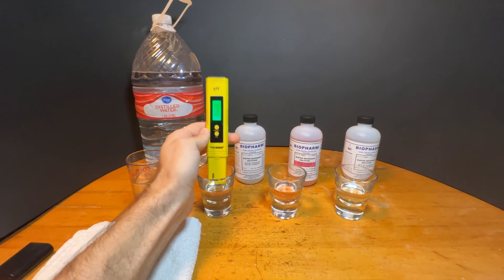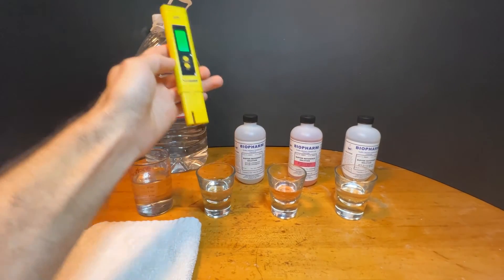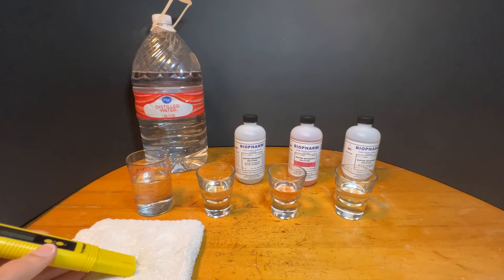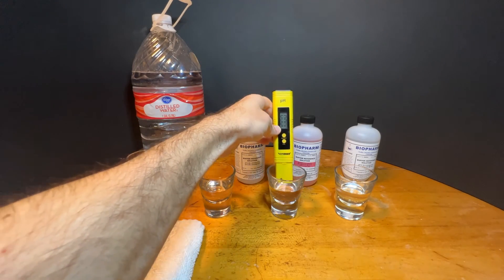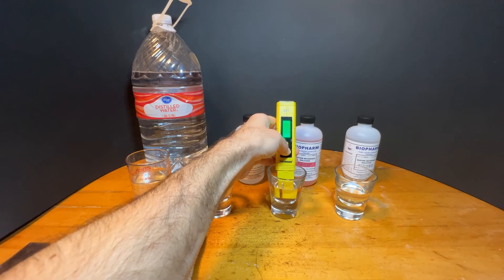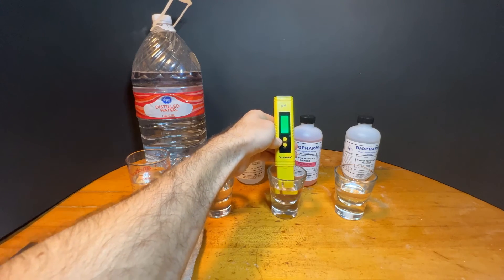You can now take it out of the solution, shake it off, clean it in distilled water, and dry it. You're going to repeat this process for all three points. Place it in the solution, press and hold the calibration button for five seconds, and when it flashes, let it go and take it out.